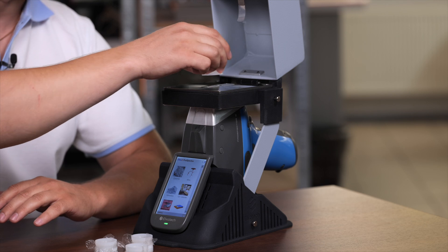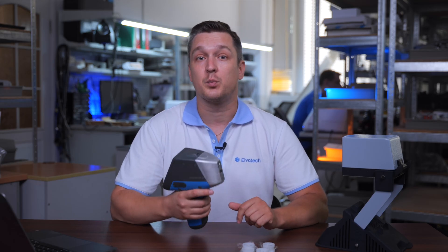Today we will show you how to easily and quickly analyze cement using our handheld XRF analyzer Prospector 3 and the lab stand. These tools help you to guarantee high quality and compliance with all necessary standards.